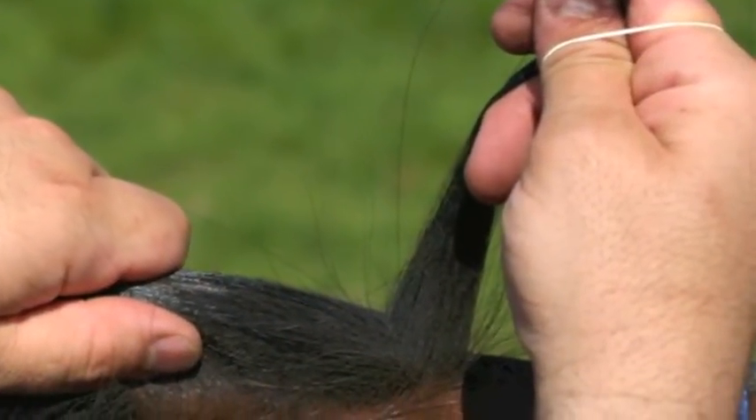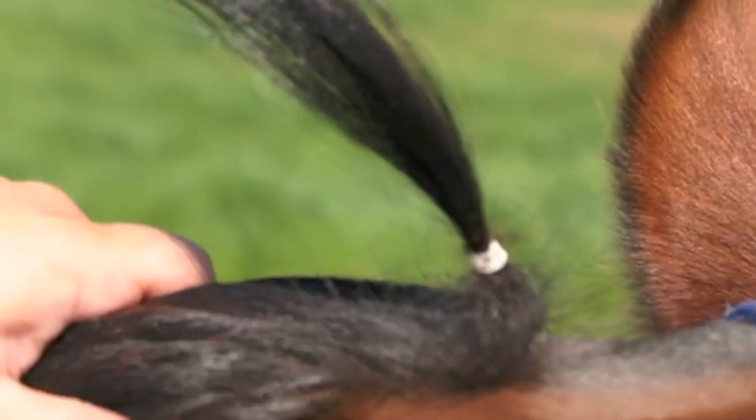Submitting your horse's hair sample is easy. First, separate a pencil width of your horse's clean mane and band it with a small rubber band.